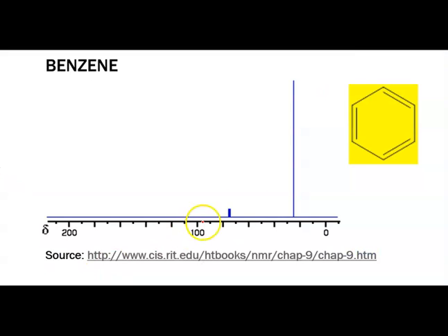This should be a fairly straightforward example, and it's a great example of how you have 1 peak, but you have 6 carbons here. The one thing I would point out is that because of the double bonds, remember those double bonds are alternating. So they're not just here as shown, but through resonance, they're also where we see single bonds.